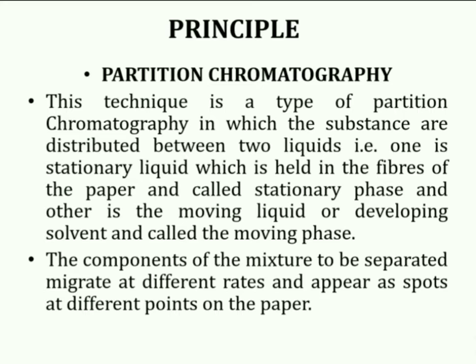Principle of paper chromatography. Paper chromatography is a type of partition chromatography which is based on partition phenomenon. In partition, substances are distributed between two liquids. One is a stationary liquid which is held in the fibers of the paper and the other is the moving liquid or developing solvent. Stationary liquid is known as stationary phase and moving liquid is known as mobile phase. Because of difference in the migration rates of the components, they become separated and appear as spots at different points on the paper.